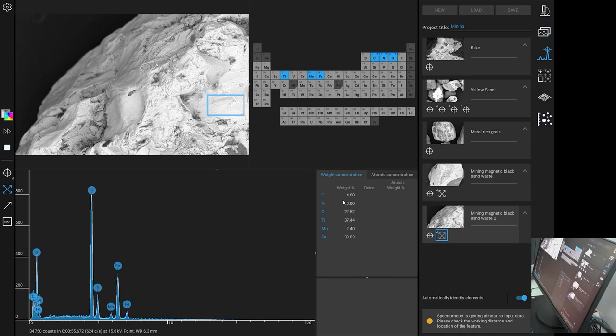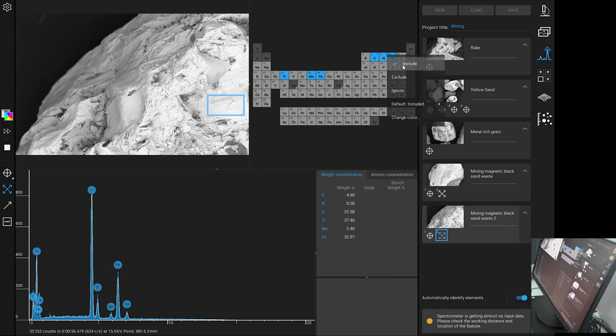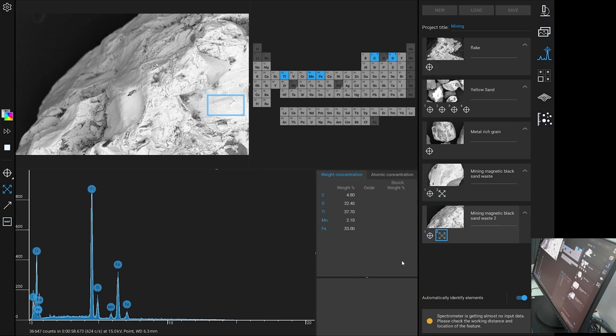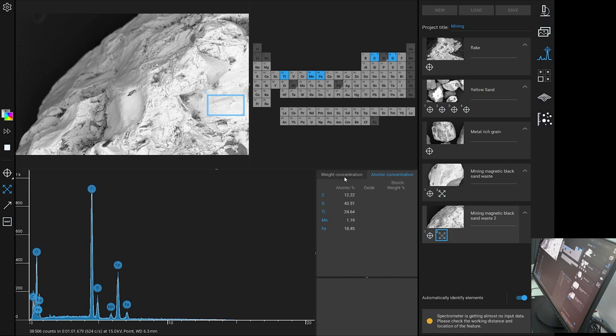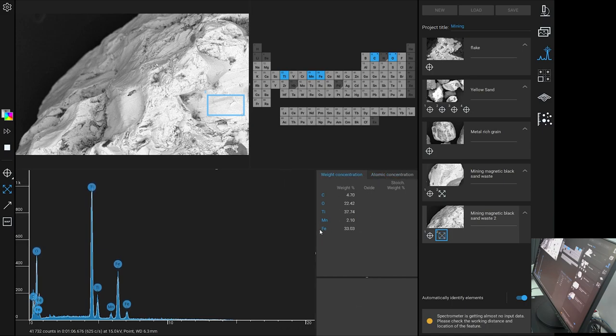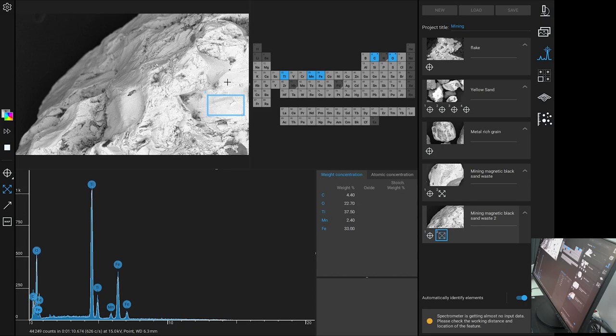I don't know why it's showing nitrogen there when there's none there. We'll exclude that. Yes, very high iron and titanium concentrations here. This had some interesting structure in bands in it, so we've got to have a closer look at that.